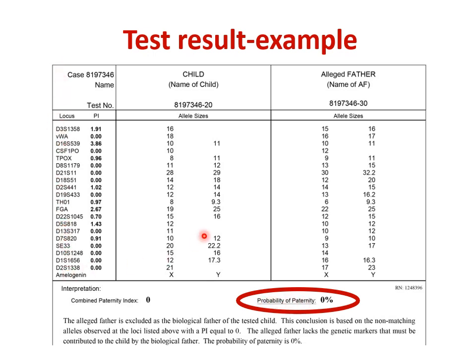They were analyzed, of course, in the child's DNA, and here in this column we have the number of repeats found in the child's DNA, and the same loci were analyzed in the potential father's DNA, and based on comparison between the child's number of repeats and the potential father's number of repeats, the paternity was excluded.